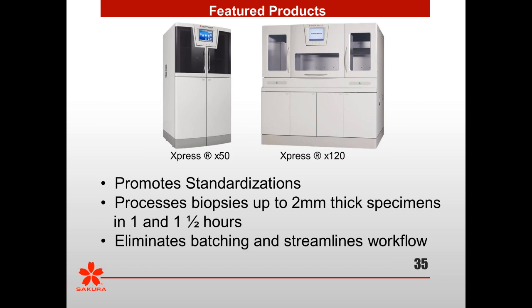So it is very useful that you have precision fixation and pre-processing protocols. I hope that answers the question.